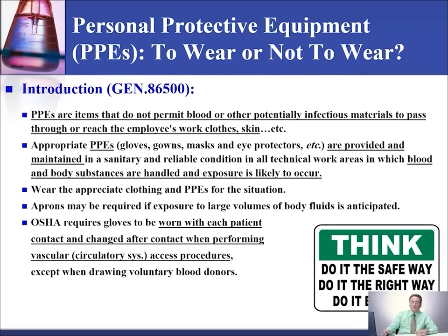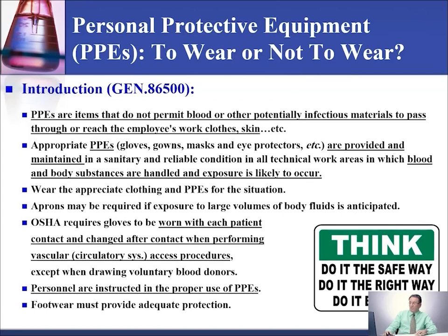So when you are drawing patients for testing, you must wear gloves and you must change gloves between patients. But when you are drawing blood for voluntary blood donations, you don't have to change gloves between donors. Personnel are instructed in the proper use of PPEs. Instructed, that means training. Also, same standard, Gen 86500 says footwear must provide adequate protection.